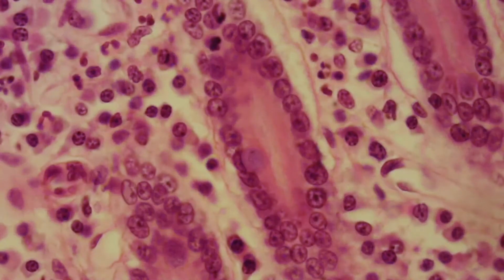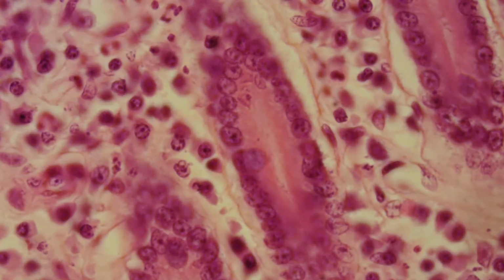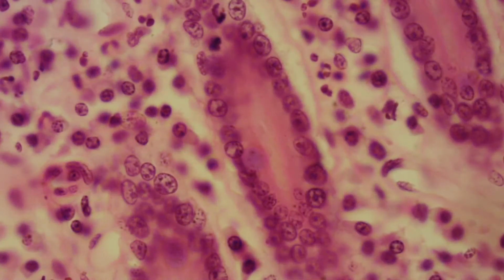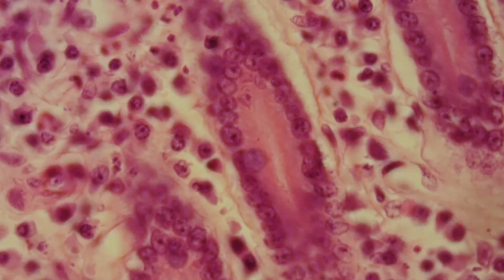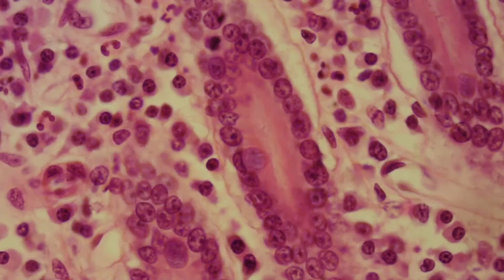This is all very useful, but this approach has several limitations. The higher the magnification you go, the narrower the range that's in sharp focus, so that even a very thin slice is thicker than the optics can hold in focus, and you end up having to focus up and down through the sample, trying to see the in-focus against the out-of-focus.